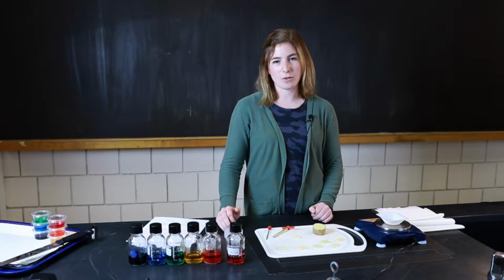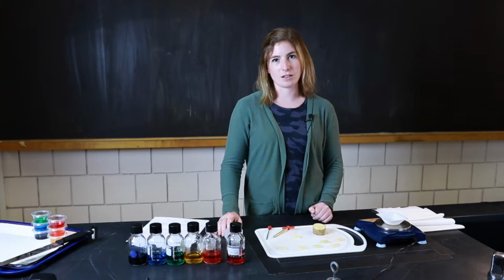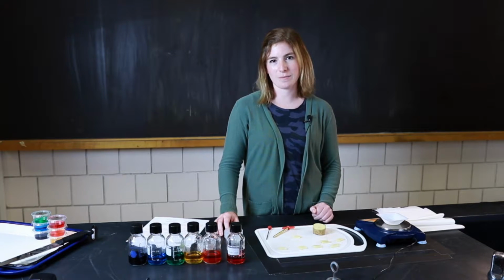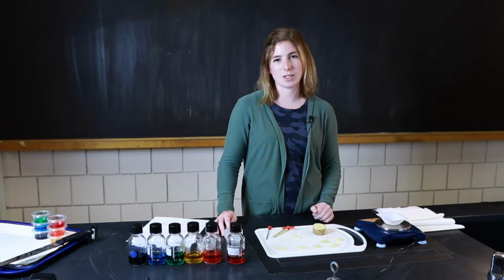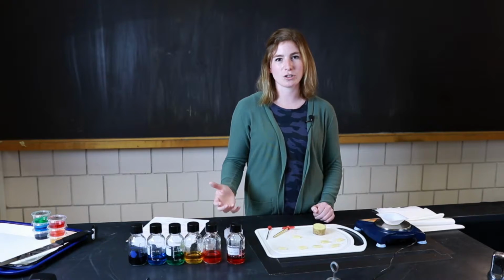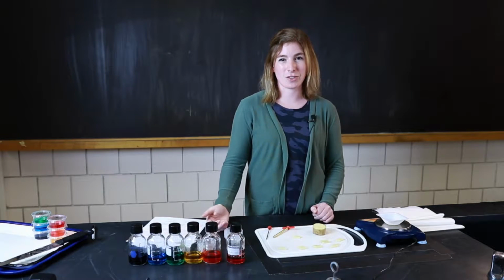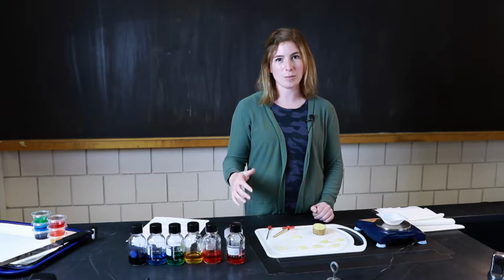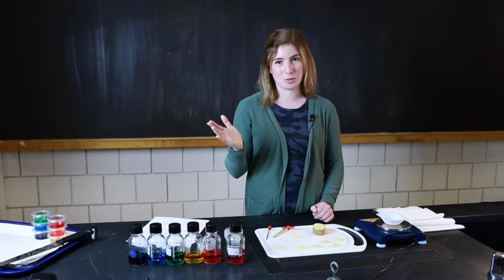This is going to be super helpful in terms of figuring out if water will move into our cells or out of our cells based on the molarity of the sucrose solution that the cells are sitting in. Today we'll be using potato cells to simulate this process because potato cells are plant cells, and so we'll be able to actually talk about the fact that pressure will build up inside of those cells as water moves into the cells. On the flip side, if water were to move outside of those cells, you would start to see those cells kind of shrivel up, which is what we see in plants when they start to lose water. We start to see them kind of shrivel up and tilt over a little bit.